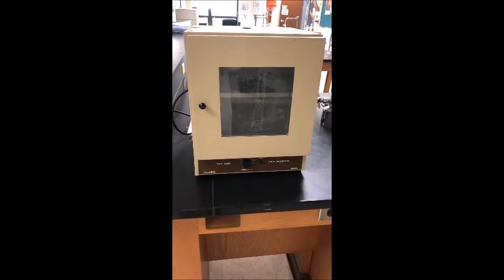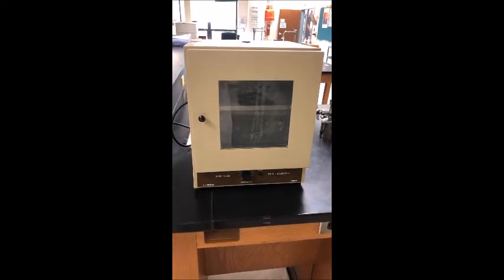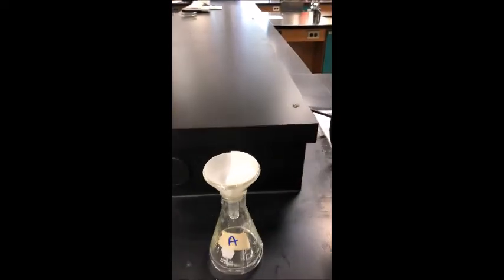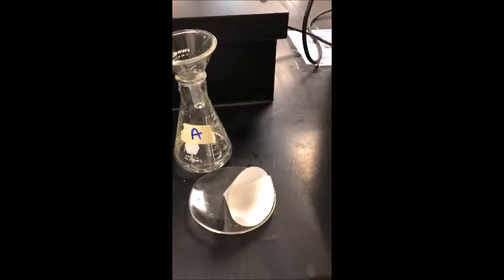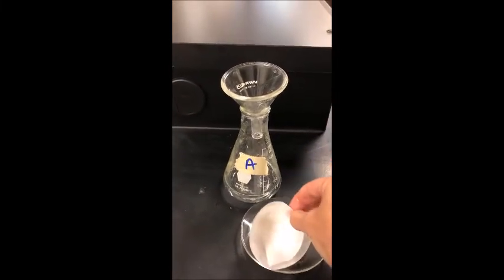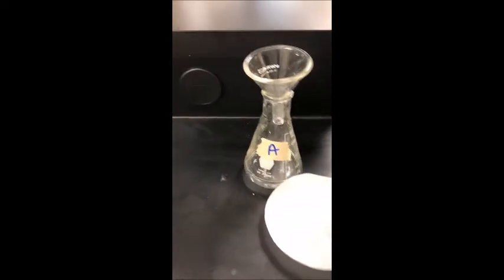Okay, so here is the heating oven that we're going to use to dry out the precipitate a little bit, and then poke through it and let it sit overnight so that I can come back tomorrow and measure the mass on it. So for our sample A here, what I'm going to basically do is take the filter paper out gently, place it here on the watch glass. As you can see, I placed it on the watch glass. Now I'm going to separate it out and expand it so that it's flat on the watch glass. Hopefully I can do this with one hand because I'm trying to video with the other. And there we have our precipitate.